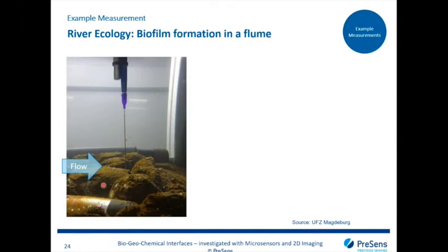So as you can see here, we used the microsensor, and the flow direction was in this case from the left, to actually map or monitor across the topography of the stone here. What you can already see very nicely is that first of all, the microsensor is really micro and minimally invasive in this system. It's so fine, it has such a small tip, it does not disturb your biofilm at all, and it also does not disturb the flow regime.